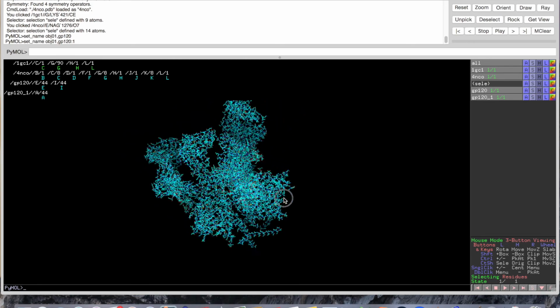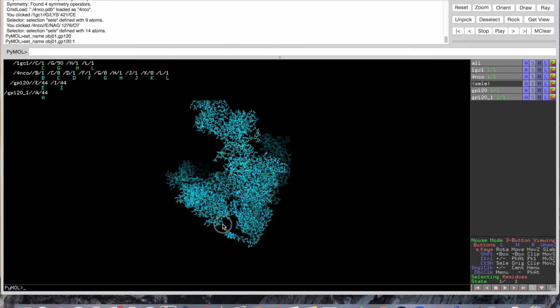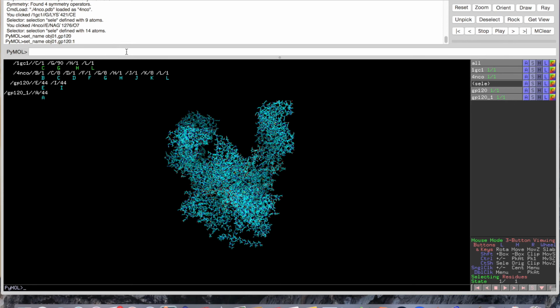Okay. So in making a movie, the first thing that you have to do in terms of your code or script, or however, I'm not a CS major, so I'll call it a script, is define the length of your movie in frames. So if you type in mset space 1x, so this is 1 by however many frames you want. So for example, in this example, I'll do 900. You can do 1,000, you can do 20, whatever you want.